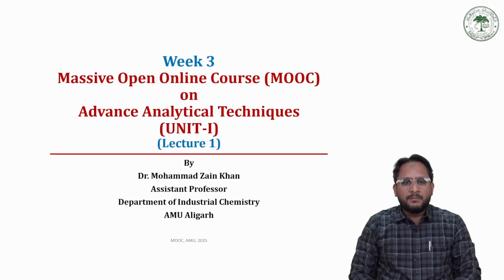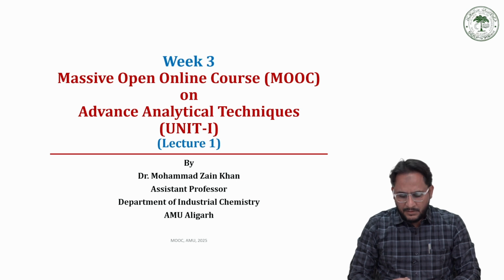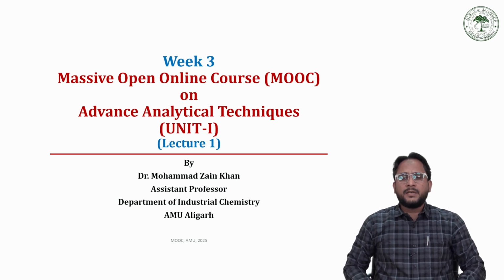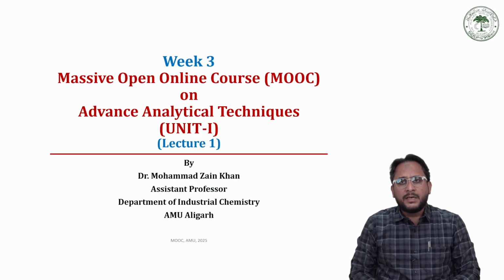Hello everyone, welcome back to the MOOCs course on Advanced Analytical Technique. We are now entering into the third week of this course, and this is the first lecture of the third week, where we are going to discuss the inductively coupled plasma technique, which is used as a source of excitation in atomic emission spectroscopy.